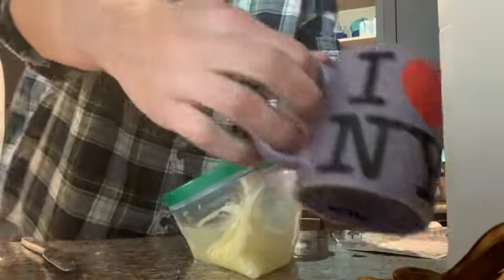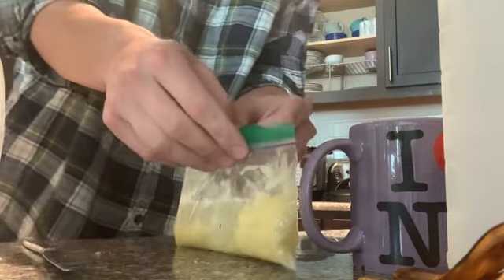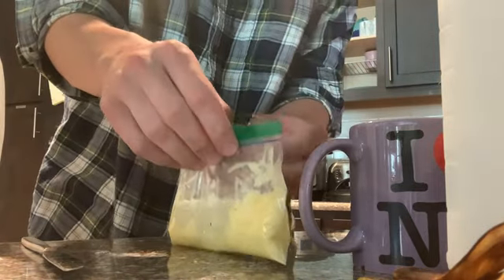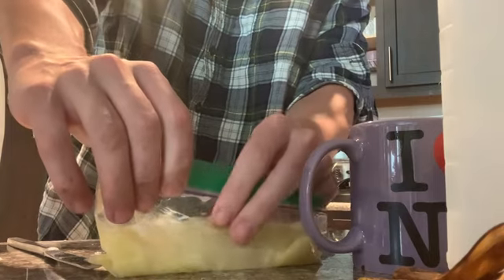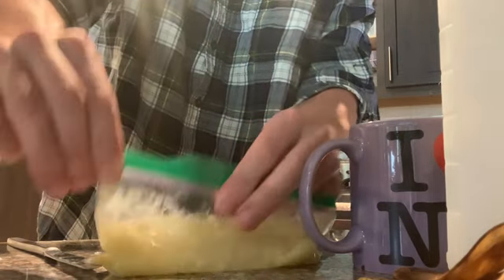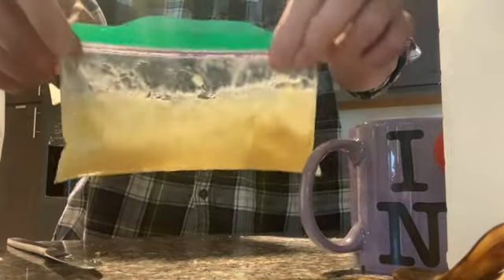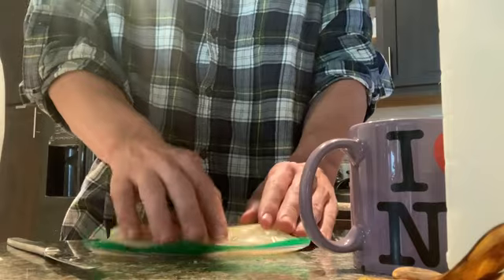Okay. Pour the salt water mix, close the bag, very gently squeeze, move the salt water banana mush together. All right, let me close that. Now something I'm going to do also is leave a small opening there on the side and try to get all of the air out of that. All right, so now we have this little mush. Let's kind of bounce it around, I guess.